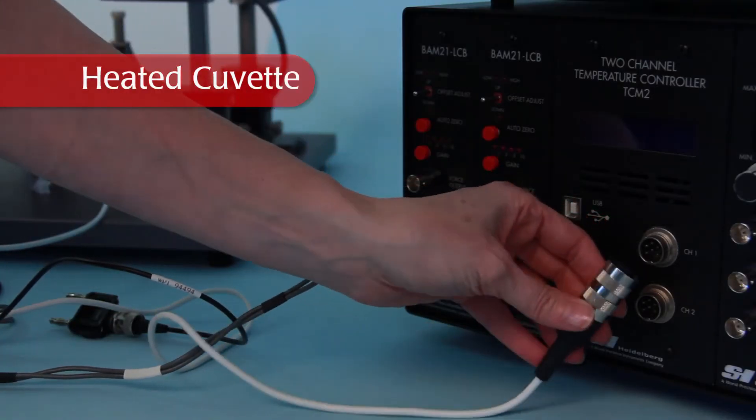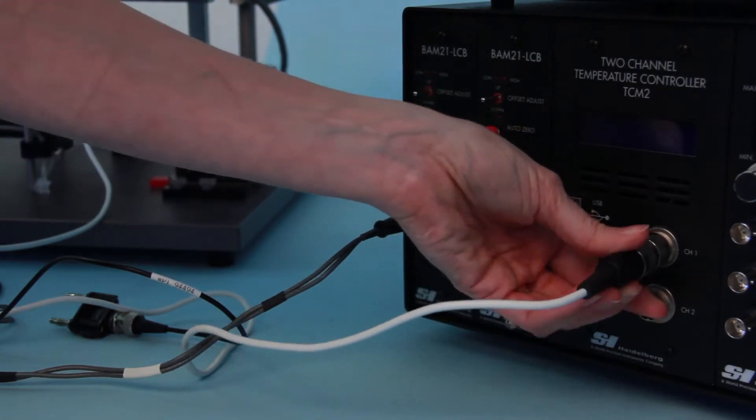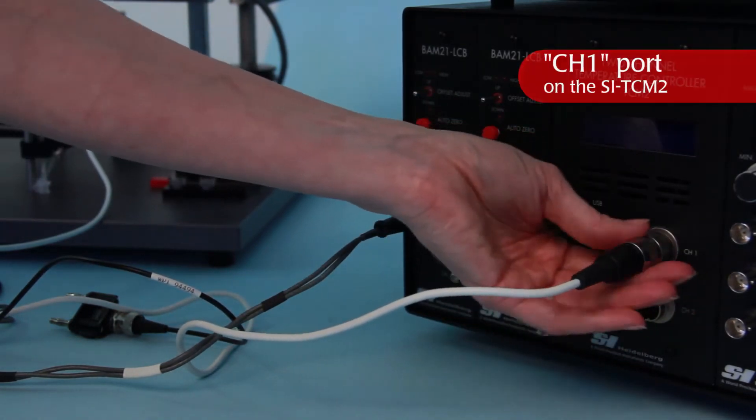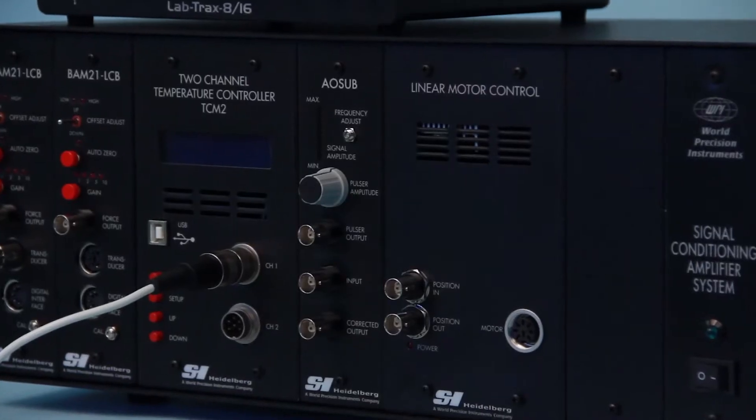The heated cuvette used in these systems has one cable with a six socket connector. Plug it into the port of the TCM2 temperature controller labeled channel 1.